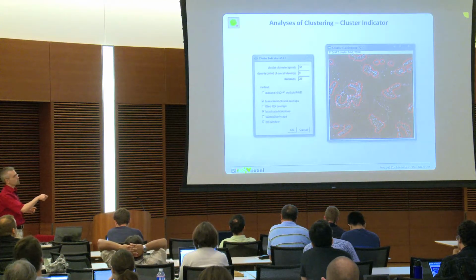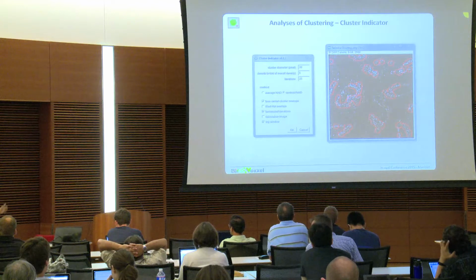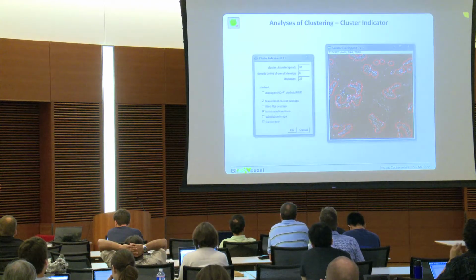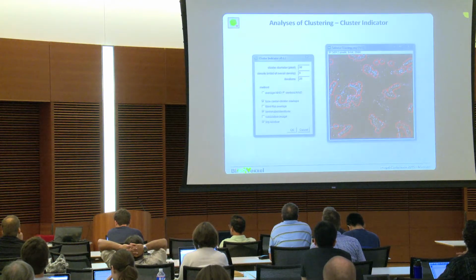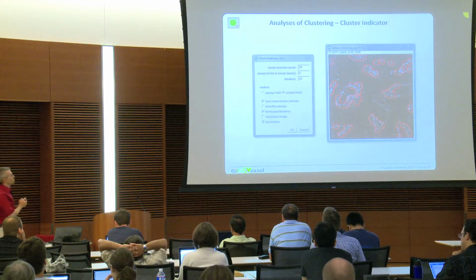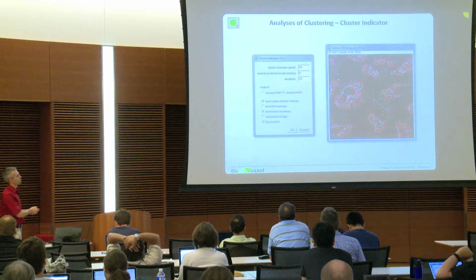And for a density, in this case, the density means you have a certain density in your image overall, and in a cluster you have a higher density. So basically, if you key in here 6, that means you identify only the clusters which have a 6-fold higher density than the rest of the image. That would be a possibility here with the size of that circle of 30.